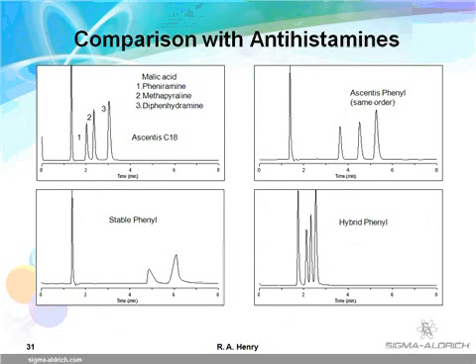The next slide shows Ascentis silica used in the aqueous normal phase mode. It can be abbreviated ANP or HILIC. In this mode, water is strong and organic is weak. Both pH and ionic strength are important variables that must be controlled. ANP or HILIC works well for very polar compounds and is highly compatible with LCMS. Please refer to other Supelco seminars for more details on this ANP topic.